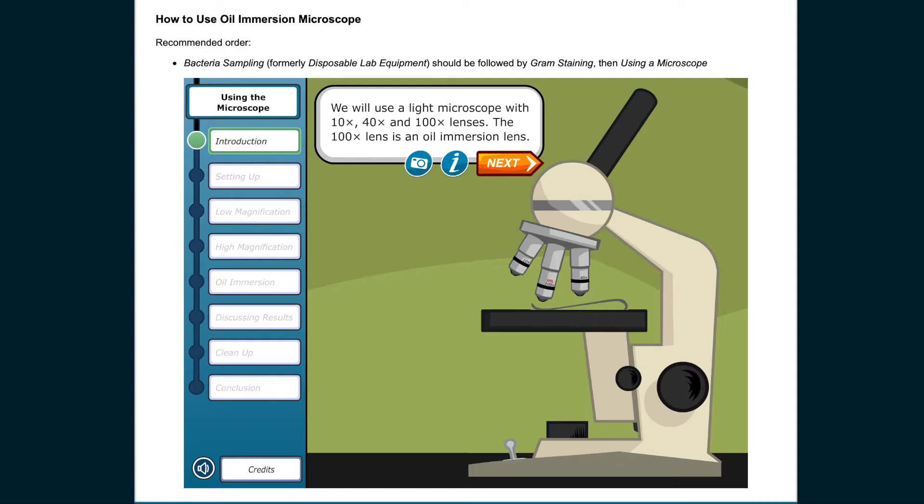We will use a light microscope with 10x, 40x, and 100x lenses. The 100x lens is an oil immersion lens.